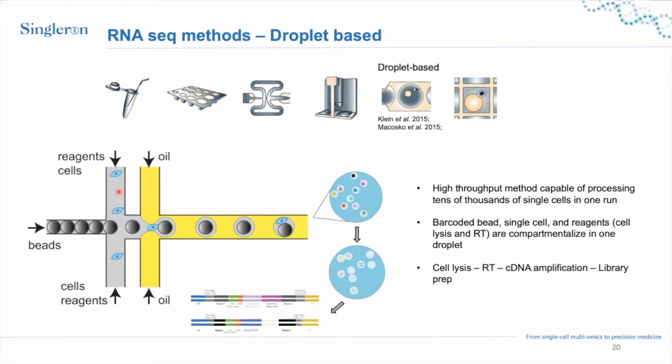So cells and reagents are pumped from one side and beads are injected from the other side. What happens is that this is a pressurized system. So once water meets the oil, due to the pressure, it creates this pinch. And then it compartmentalizes cells together with the beads.